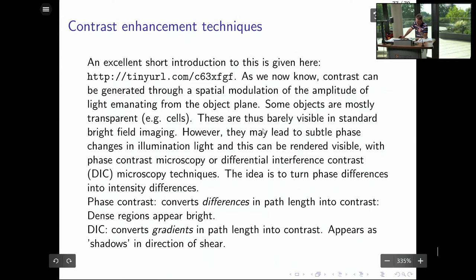Okay, finally, I'll finish this lecture with one small diversion, going back to bright field imaging techniques. You remember in bright field you have the background of the excitation of the transmitted light. You're not interested in the light per se, you're interested in the stuff that's refracted from the sample. That's the stuff that actually bears information about the sample.